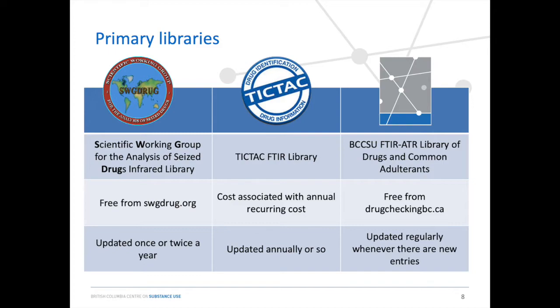The reason we created this library is because there are some new psychoactive substances that appear in our drug checking service that do not have available references yet. This is because other libraries are updated irregularly and infrequently. When a sample comes in for drug checking that does not have a reference, we can forward the sample for confirmatory testing in the lab, and once it's confirmed, we can use the original FTIR scan as a reference for future samples. These 3 libraries are what we call the primary libraries, and are generally the 3 that you should have on when drug checking.